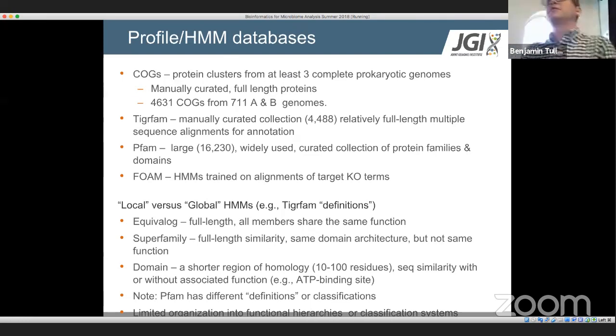So it gives us some information. It allows us to go down a rabbit hole a little bit about hypothetical proteins. If you're working with one of the many organisms that has less than 30% annotatable genes, this is an avenue for you to take where you can start to look at and maybe conceive of ways of how these proteins might be functioning in the cell.